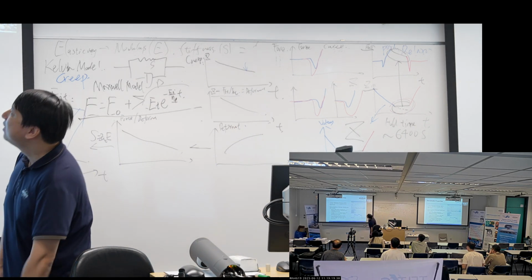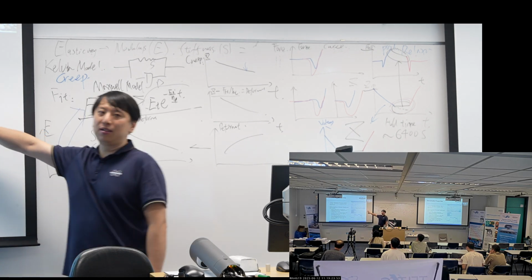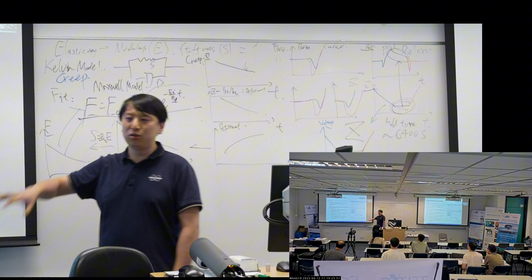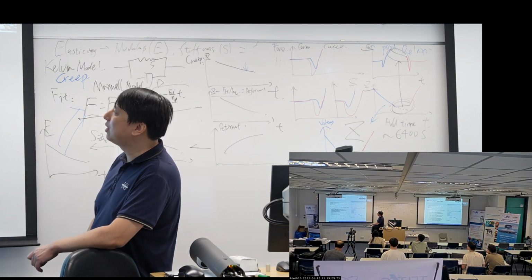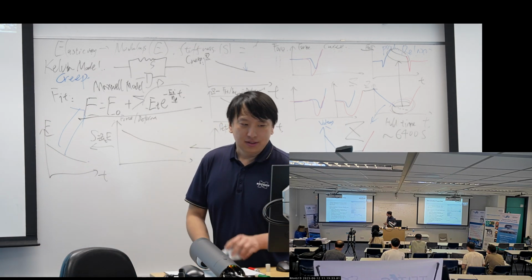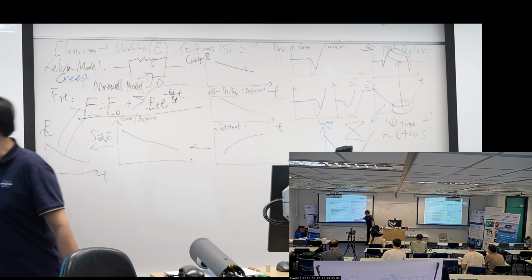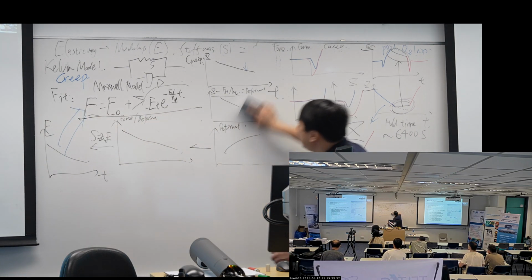So ramp scripting lets the user make custom-designed force curves. So let's give a brief explanation.